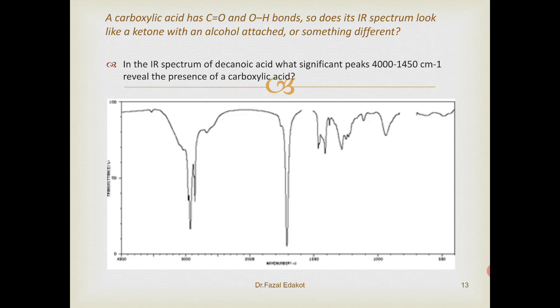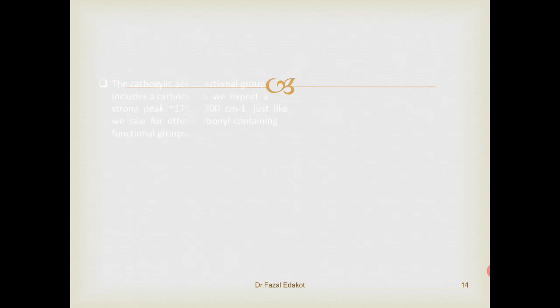So we'll work out a few spectra, and you will learn much better when we take all the NMR, all those concepts together. So this is the spectra of carboxylic acid.